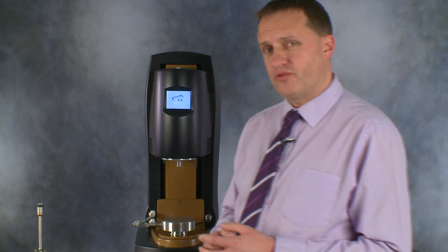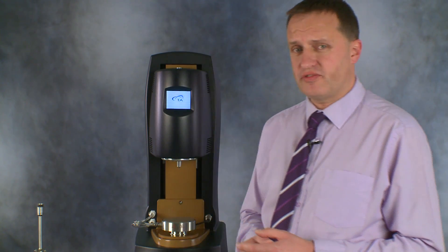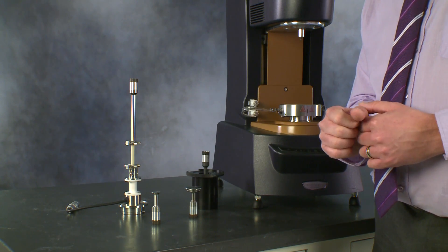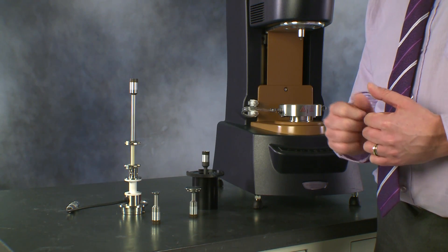To finish off, if you get a sample that's so stiff, then we end up using the torsional clamp system which enables us to measure solid samples and bars over a range of temperatures and transitions.